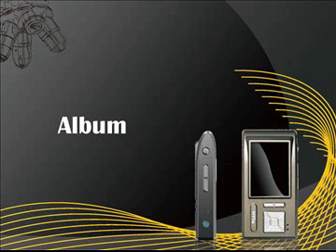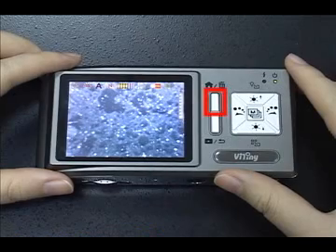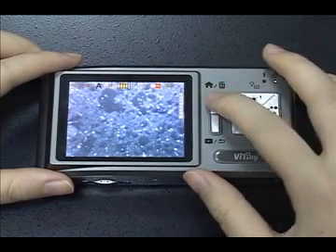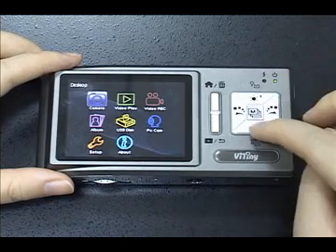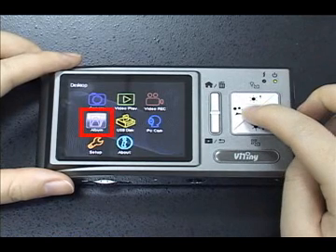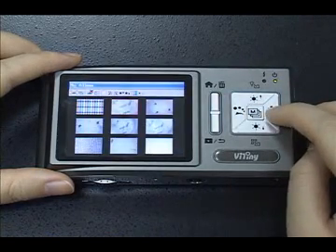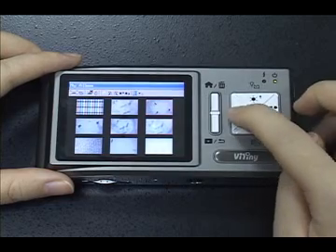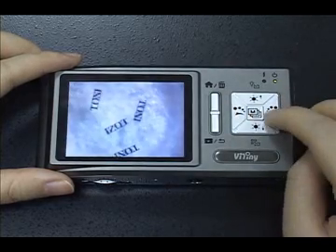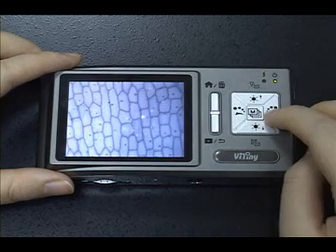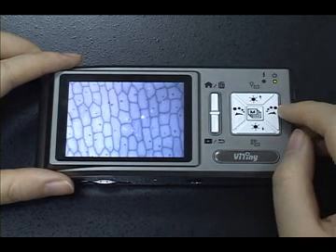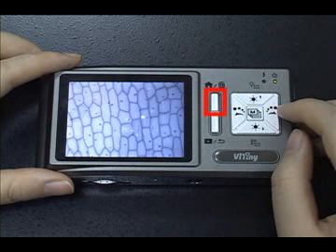Photos Album: press the Menu button to enter the menu display. Select the album icon to see all captured images. Press the middle button to get full screen display. Press the Delete button to delete an image.